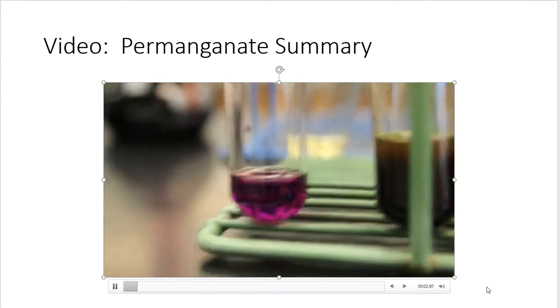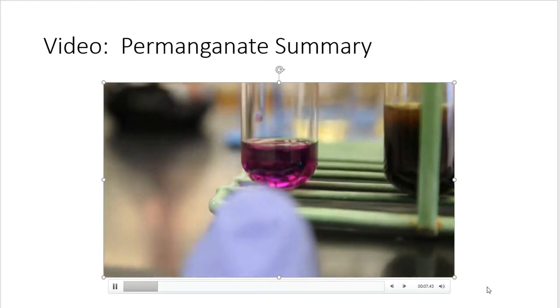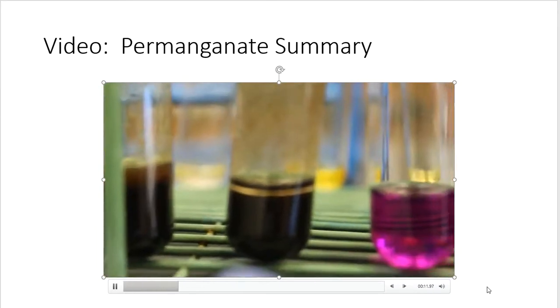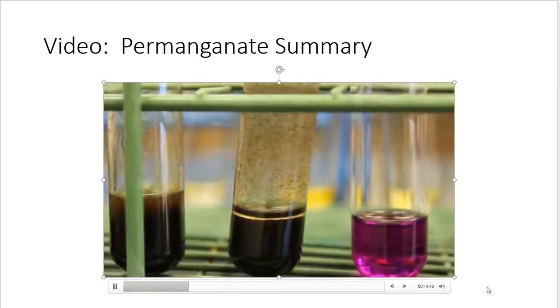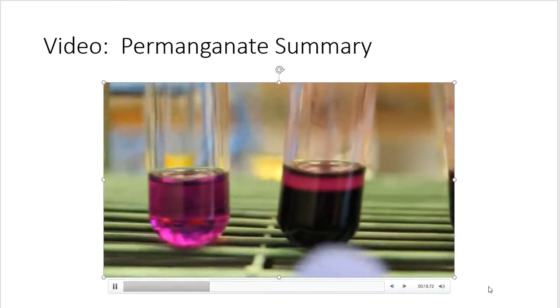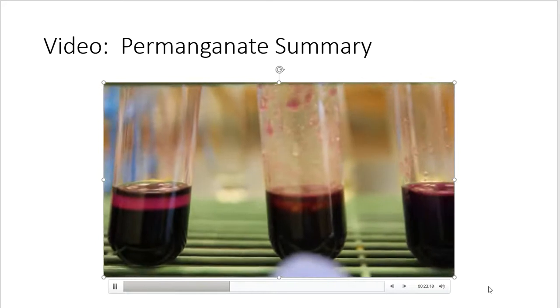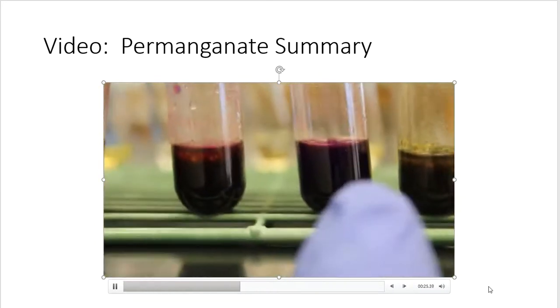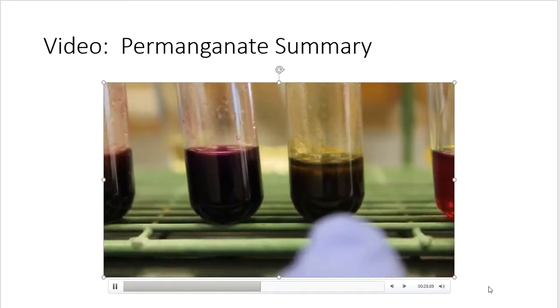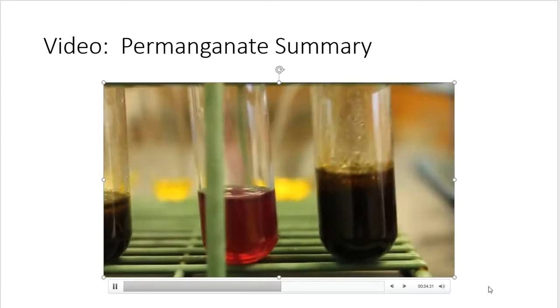So just as before, we're going to go through and look at all of them together. Here's the acetone control. My turpentine's next. My cyclohexene. My cyclohexane, A-N-E. My toluene. My canola oil. My mineral oil. My octene, E-N-E. My unknown number 1, and my unknown number 2.